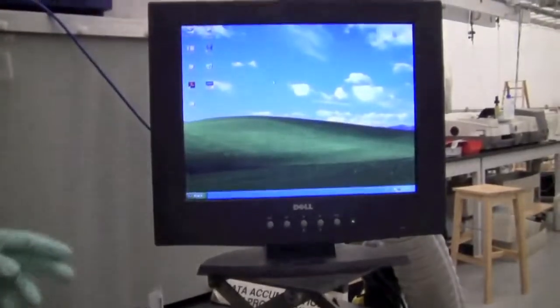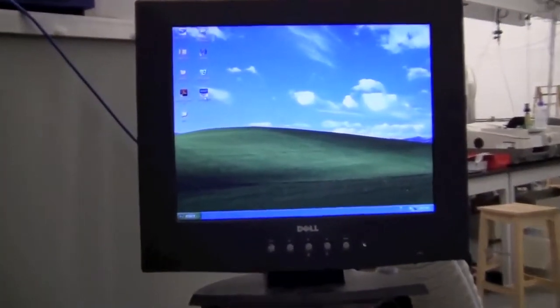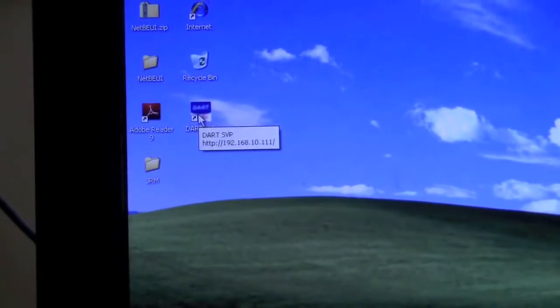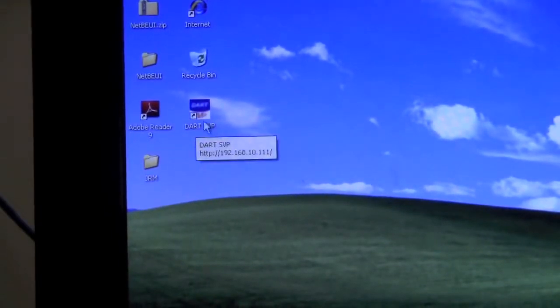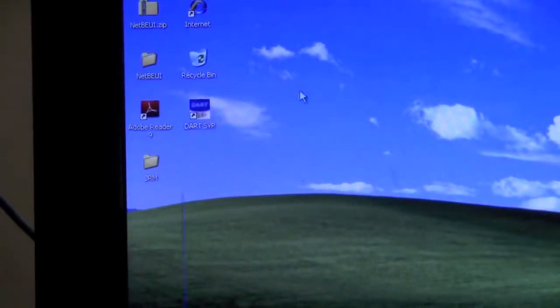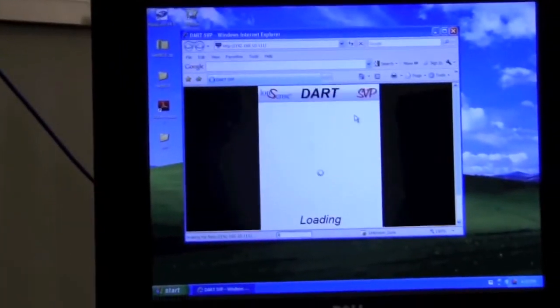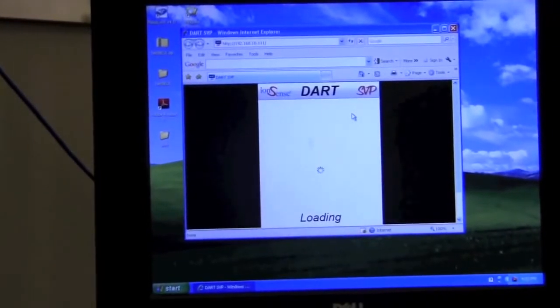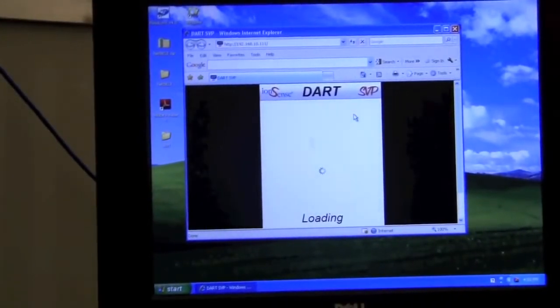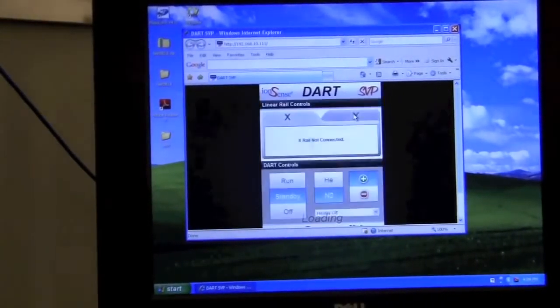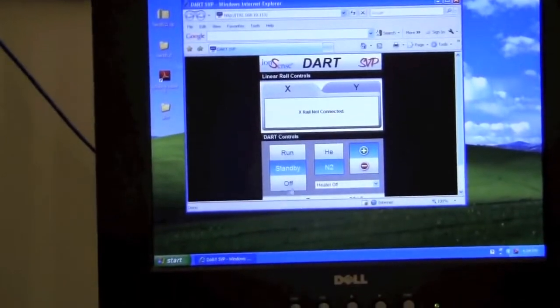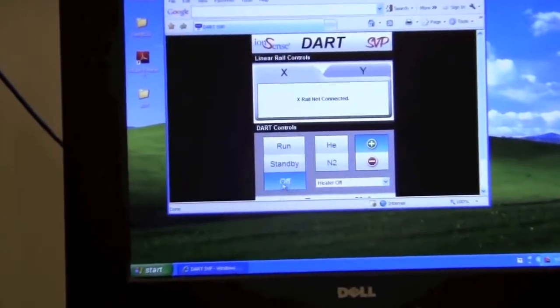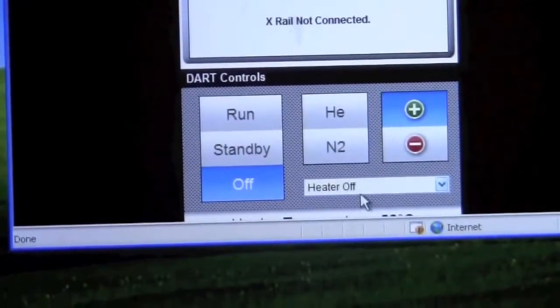The first thing you want to do is to open the DART page to get the DART source started. So double-click on the DART SVP link. It will open up a web page which will show the status of the DART source. When it's not in use, it should be off with the heater off.